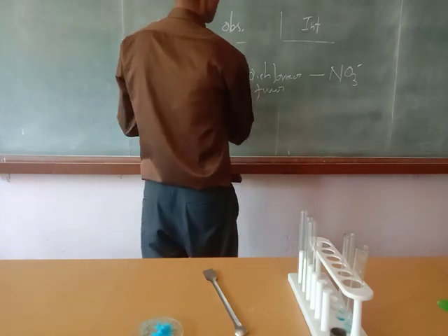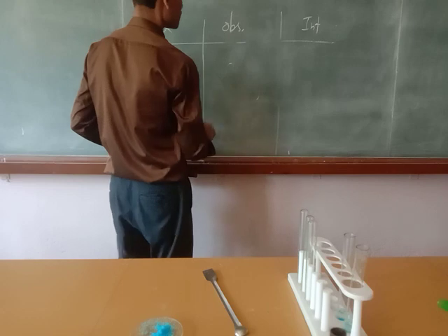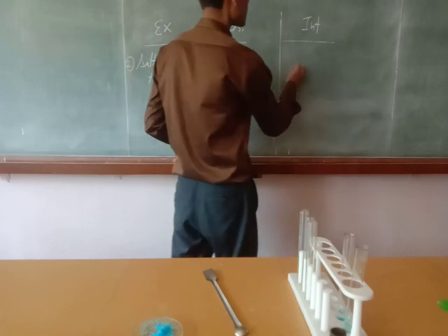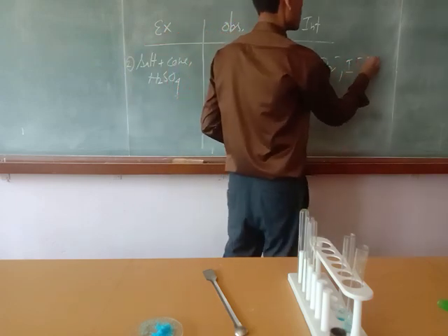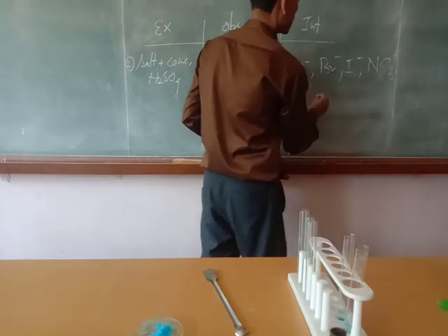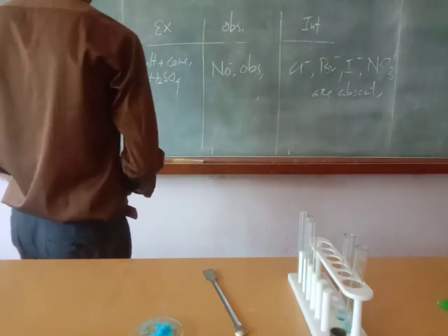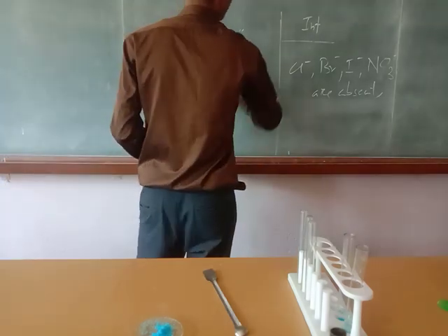Here you simply write no observation, and in inference, chloride, bromide, iodide and nitrate are absent. So our dry test has been completed.